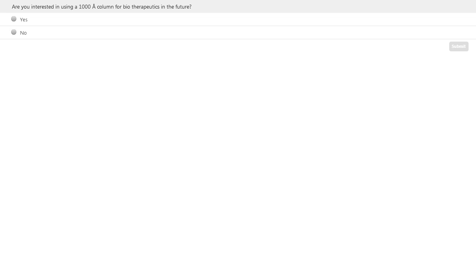So that's one way to get around this high temperature fragmentation if that's something that you're concerned with. So I would recommend to just go to lower temperature and work with a mobile phase system that provides you with reasonable recovery for your experiment.